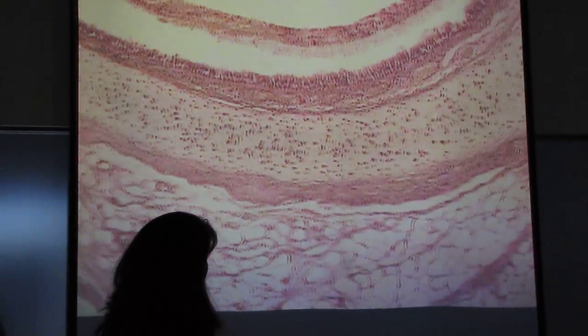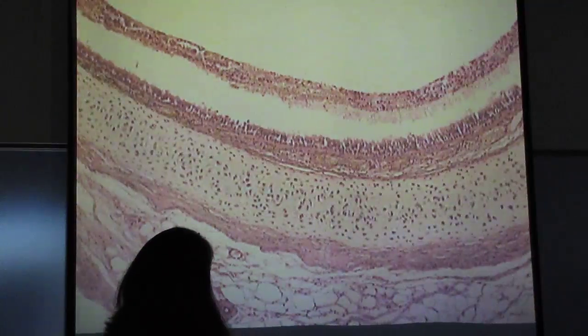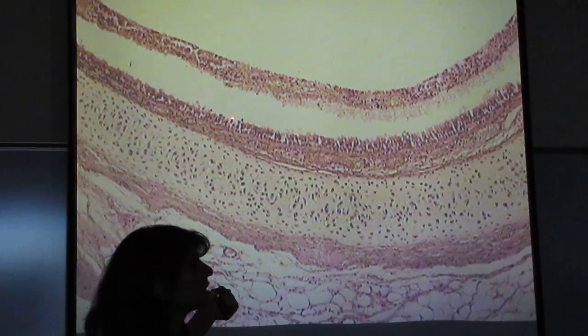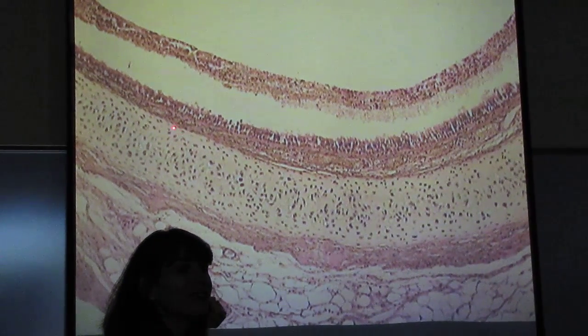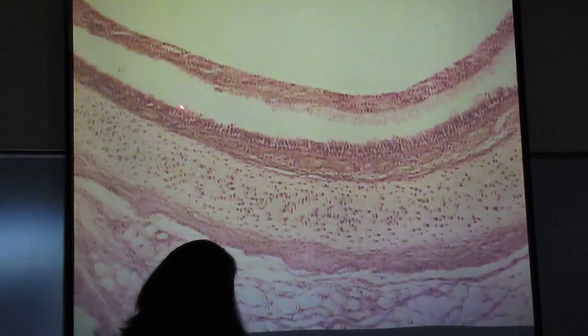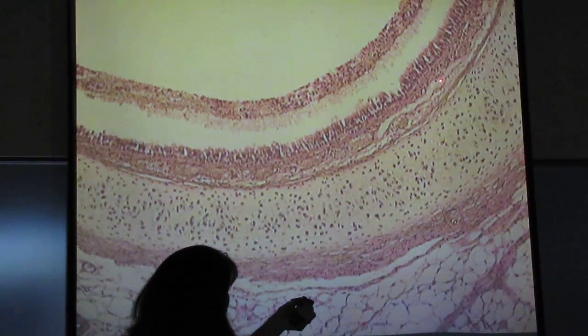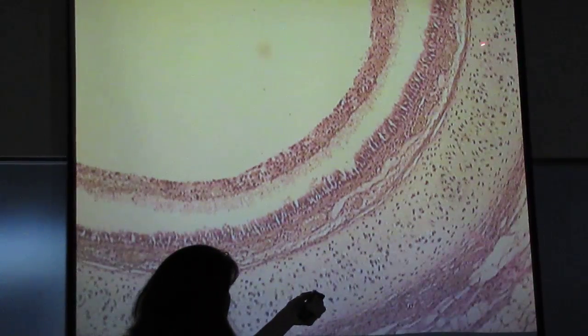Where's the lamina propria? Where are the seromucous glands? The seromucous glands are right here. This was just a thin little layer with no seromucous glands. So was that Elsa? It sounded like Elsa. Where are you? Right, oh, Elsa, over here. See, no seromucous glands. Over here, it's a little bit thicker, seromucous glands. So right here. So let's increase our power right here.